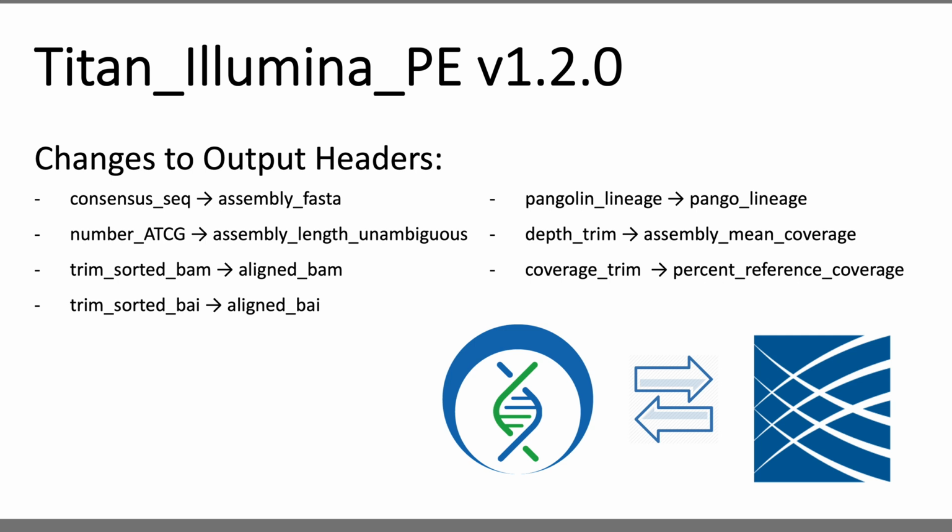This was done in an attempt to synchronize naming conventions with work being done at the Broad Institute, particularly by Danny Park. Our hope is that by utilizing the same language for these outputs, we can further increase interoperability of our works so that we can all take advantage of the downstream tools we're developing for things like report building and dashboarding. So after analysis is complete, you'll see these new output headers. I'll be making a follow-up video soon to show laboratories how to modify your current data tables to match these new headers to keep everything in sync and organized in your workspace.